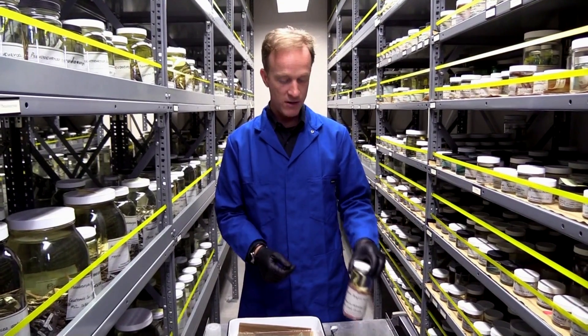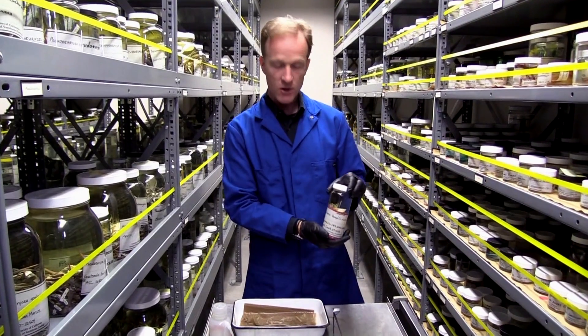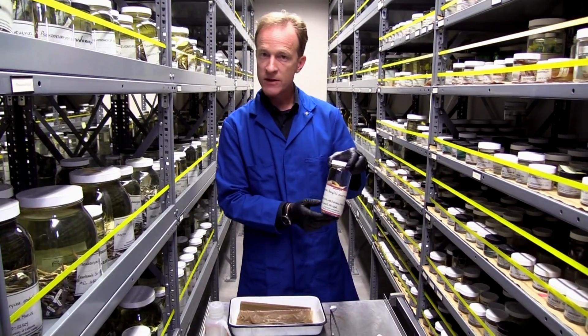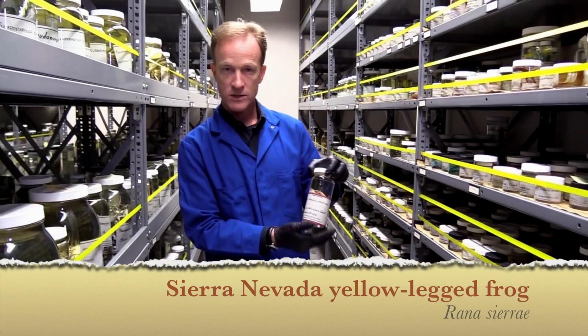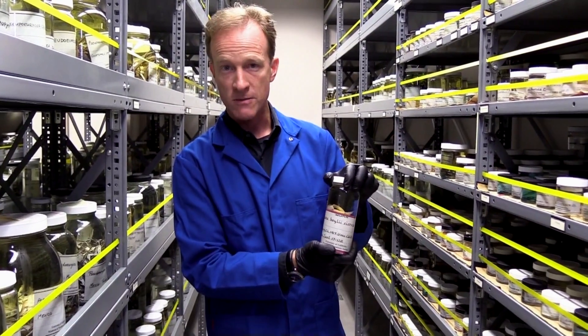My name is Vance Riedenberg, and I'm here at the Museum of Vertebrate Zoology in Berkeley, California. I'm going to show you how to collect a skin swab from a museum specimen. This is a very special specimen called Rana sierrae, which is our Sierra Nevada yellow-legged frog that lives here in the mountains in California.